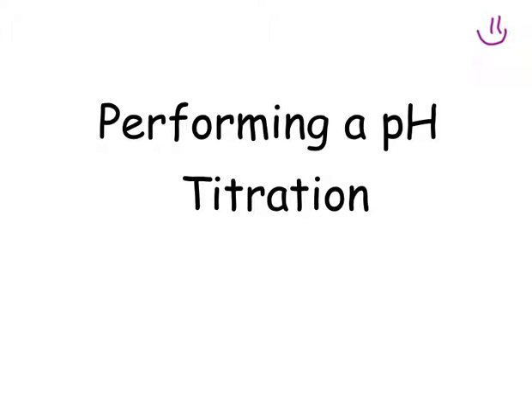All right, thanks for joining us watching this video. It's really important that you watch, because I promise you watching this titration video is going to make your titration experience so much more pleasant because you're going to have some sort of idea as to what's going on.